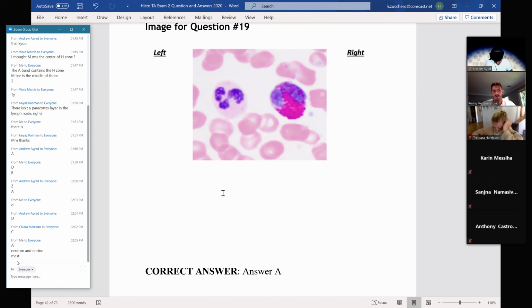So it's important to know what these cells look like and what's inside these cells, because she could very well just pick an image just like this of one cell and ask you what it is or what it does or what kind of situation you would find elevated numbers of it. So it's important to really understand that hematopoietic stem cell tree that tells you which one derived from what, what they kind of look like, and what kind of situations you're going to find elevated levels.